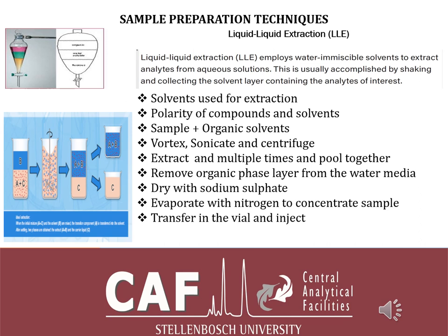Liquid extraction involves a water-immiscible solvent like hexane or ether or dichloromethane or chloroform that extracts the analyte from the aqueous solution, aqueous meaning mostly a watery medium, and then you shake, release the pressure, shake, release the pressure. Depending on what you're using, if you're working with dichloromethane, for instance, your dichloromethane will be at the bottom and the water at the top. If you're using ether, your ether will be at the top and your water medium at the bottom.